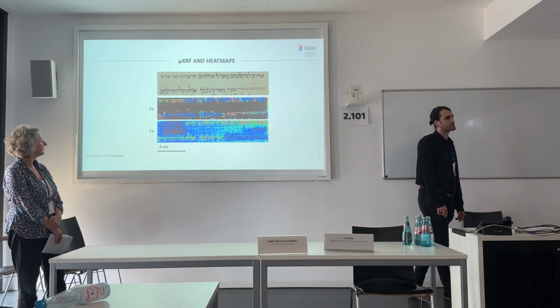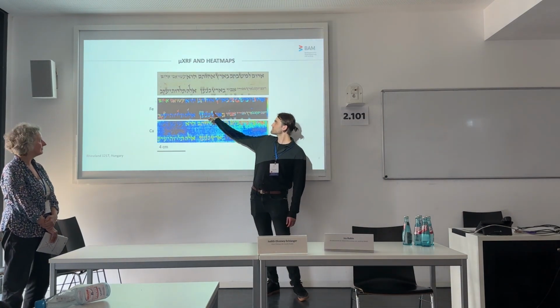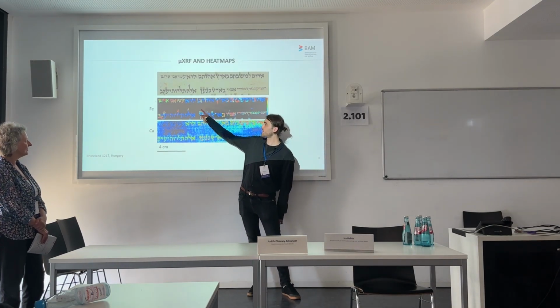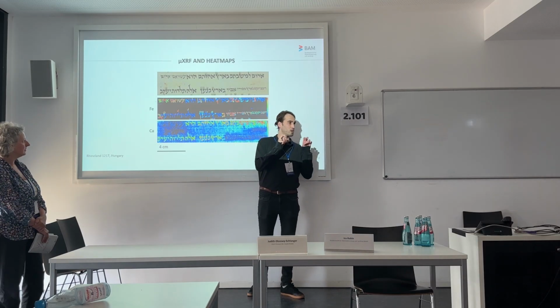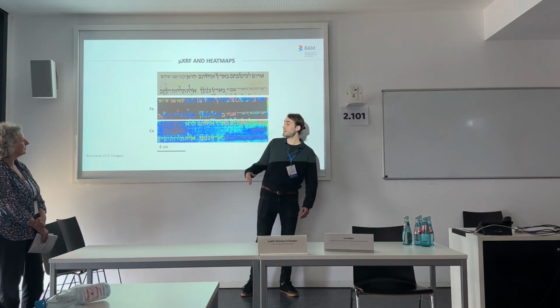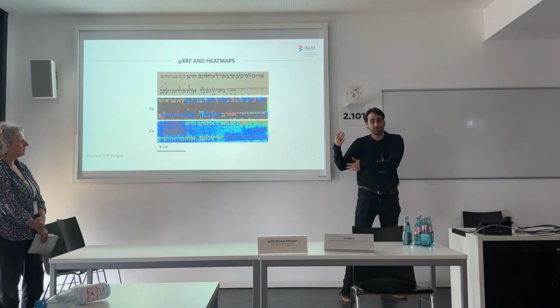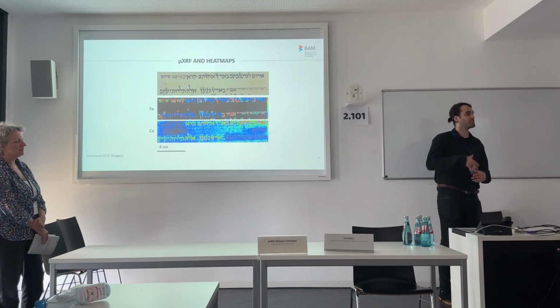But is there anything that your analysis of spectra can tell us about time in terms of the writing? Let's look at this small area here, for instance. We see that the main ink, the original ink, is expressed in this dark blue color, corresponding to low abundance of iron in this case. The addition of those crumbs is expressed in a brighter color, corresponding to the fact that it was added later to the original. So it's a different stage.